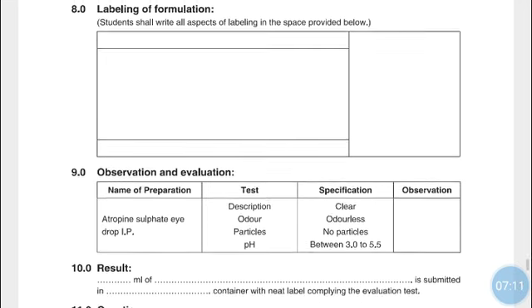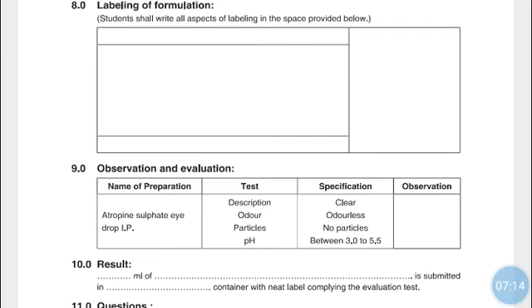Observation and evaluation: the solution should be clear, odorless, particle-free, and the pH should be between 3 to 5.5. Write down the evaluation test results. The result is: 10 ml of Atropine Sulfate Eye Drop IP is submitted in a plastic container with a neat label complying with the evaluation test.